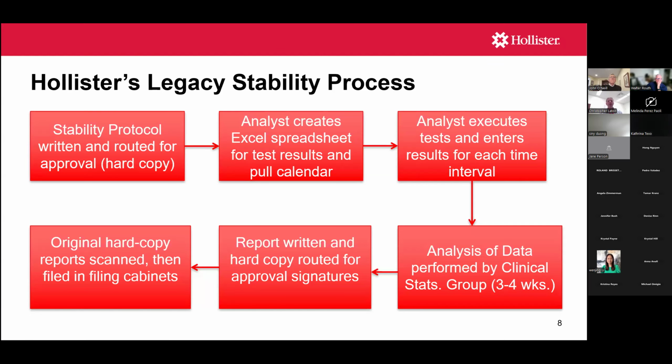So this is our legacy stability process. Now I should mention that we did our initial LIMS implementation back in 2014, so this predates this. However, there's probably companies out there now that handle things the same way that we did back then. So it's a very manual, labor-intensive system.